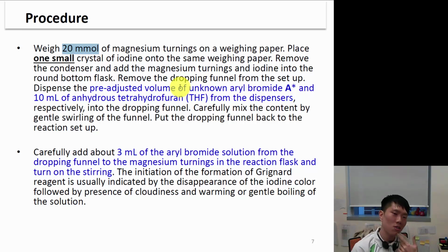Then it's good to consider, why did that happen? Am I even heating the reaction mixture? Do we need to heat it up?